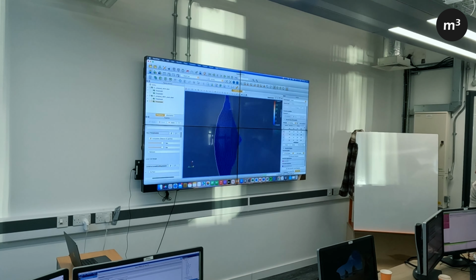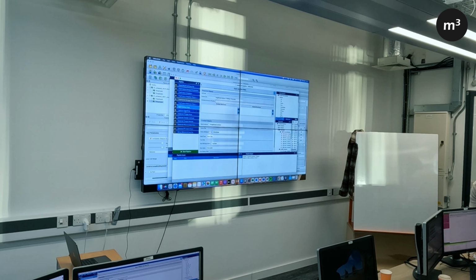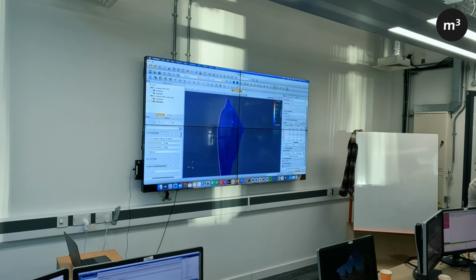So if we go back to here, smoothing, there's only one iteration step, so we haven't done any smoothing. So that's why it looks like that. So that's something for you to play with. But now you can see we haven't got the entire grain surface. That's because there's some other face labels in there where 164 was on the other side of the boundary.